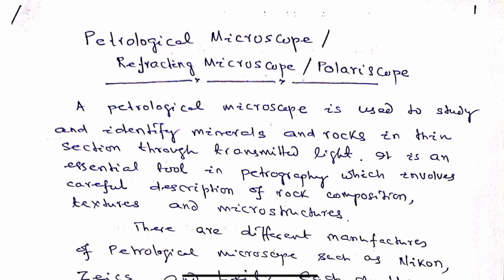Hello students, today we will discuss the petrological microscope, which is used to study the slides of rocks and minerals in order to identify the minerals and the rocks. So let us start. The petrological microscope is otherwise called a refractive microscope, or it can be called a polariscope.